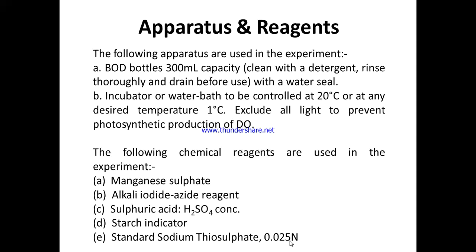You will see, students, that all the reagents required in the experiment are basically the same as those required in dissolved oxygen. In the DO lab that we did, you will see that more or less the same reagents are required in determination of BOD, because BOD is eventually the difference between initial DO and final DO.